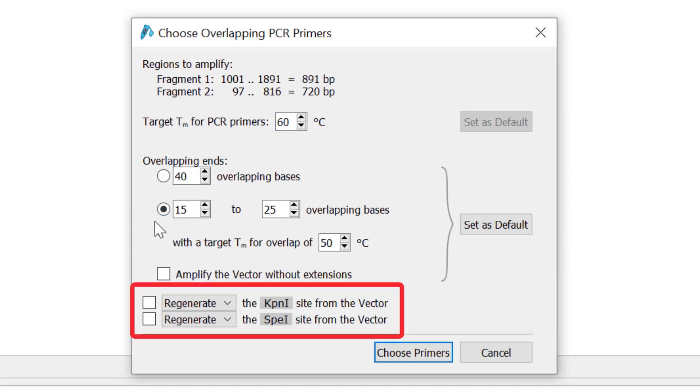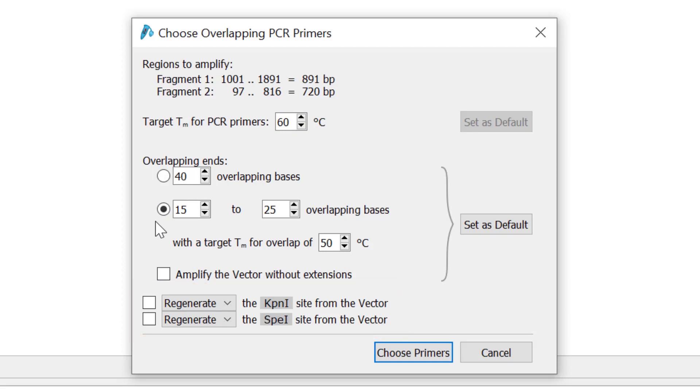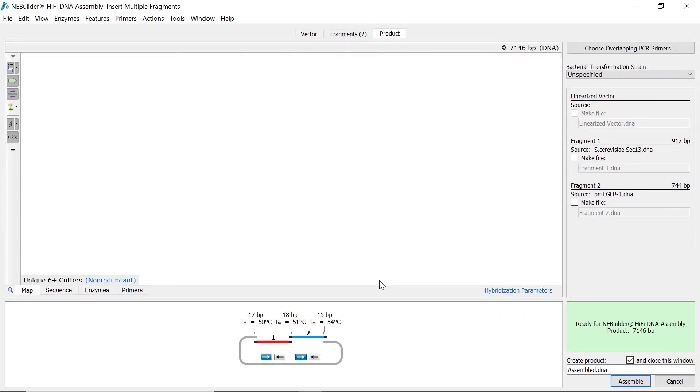At the bottom there is also the option to regenerate or remove the partial restriction sites at the ends of the vector. Once you are happy with the primer settings, select the choose primers button.